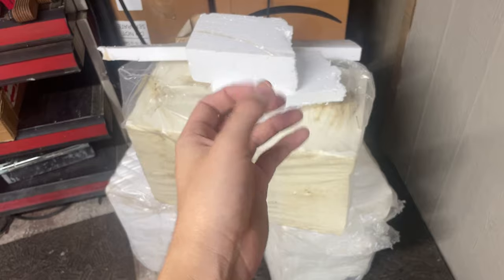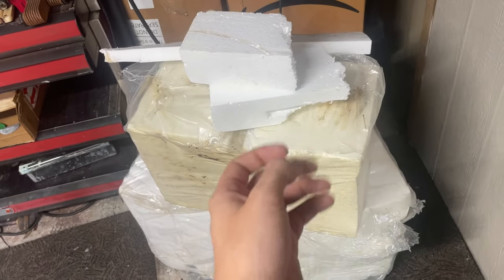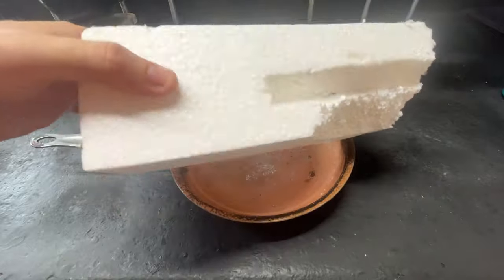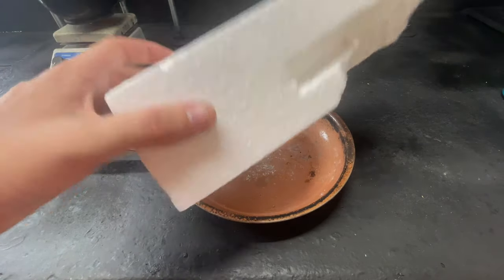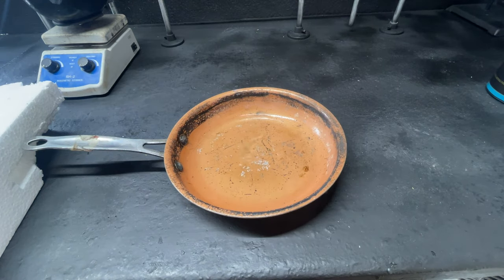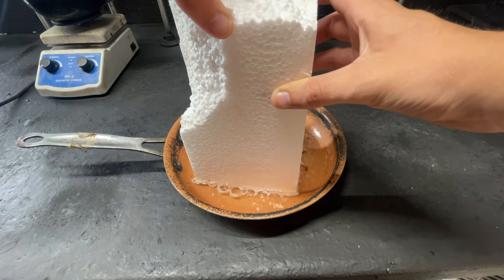I had to go out earlier to run some errands, and while I was out I decided to stop at some stores and check their dumpsters to find some styrofoam. Found these massive blocks of styrofoam, which will be plenty of polystyrene to make our benzene. First we've got to condense down our styrofoam because for the most part it's mainly air at the moment, so we've got to dissolve it into a solvent. To this dish I'm just going to add some acetone. Now it's time to add our styrofoam.